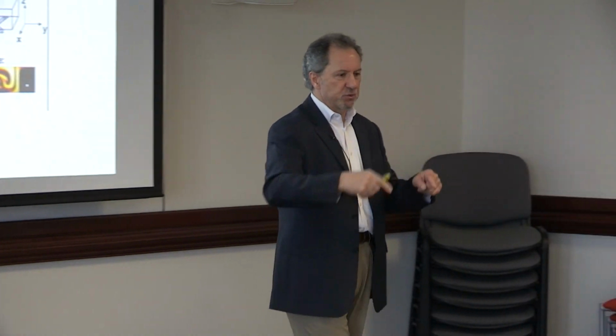Now what happens when you want to mix? Because if we're going to do chemistry by adding multiple reagents, you've got to mix things up. George Whitesides and a number of other people, Howard Stone at Harvard, have shown that you can now put structures into the channel that actually cause, in some physically predictable way, a mixing of the fluid. And so one of these things is to put in these chevrons, these herringbone structures.